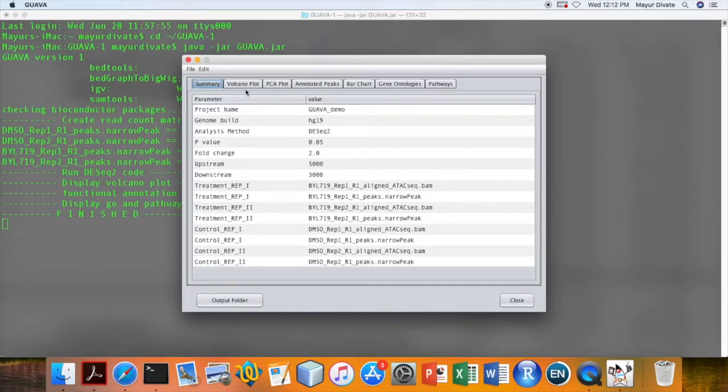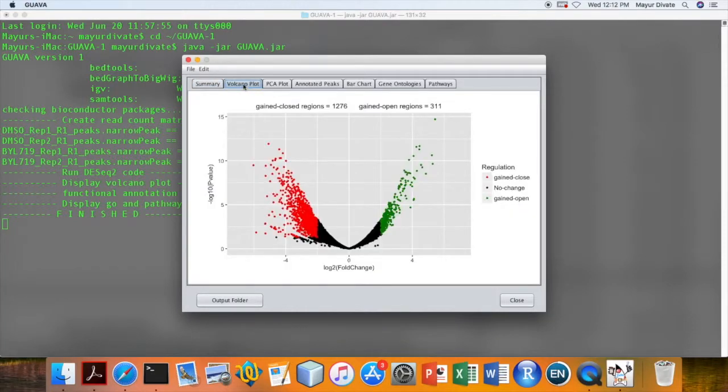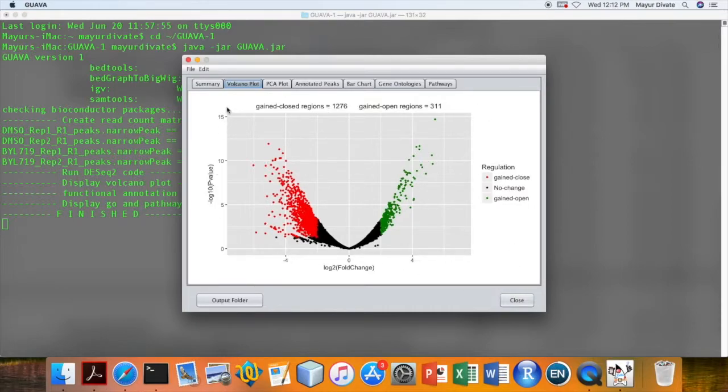First tab is for input summary. Then second is for volcano plot showing the summary of differential analysis.